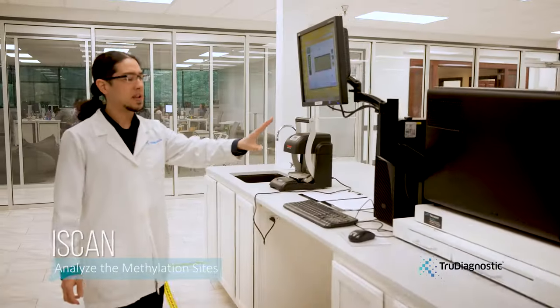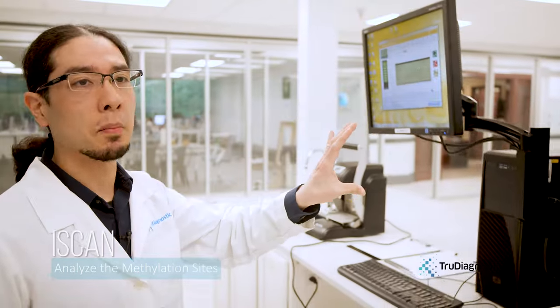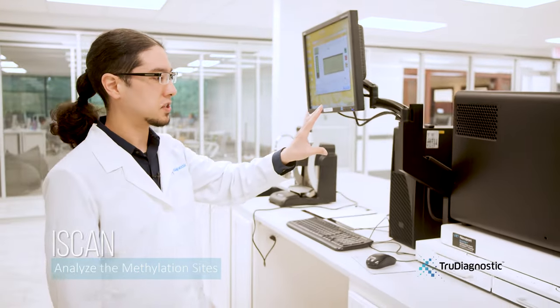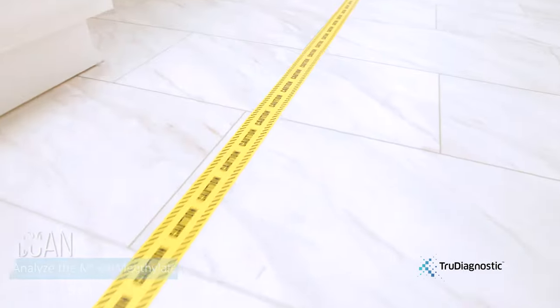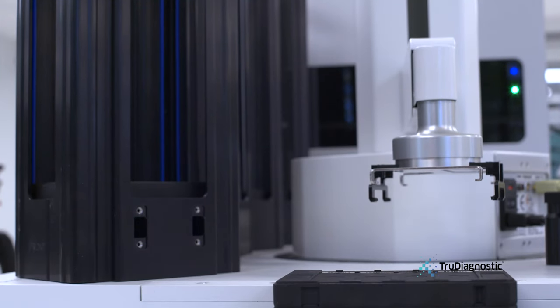Here we have the iScan machine. This is the state-of-the-art Illumina machine that will scan the actual bead chips for the DNA methylation sites. As you can see, we have yellow precaution tape around it because this is the most sensitive piece of equipment that we have.